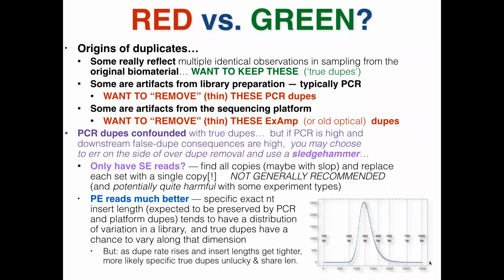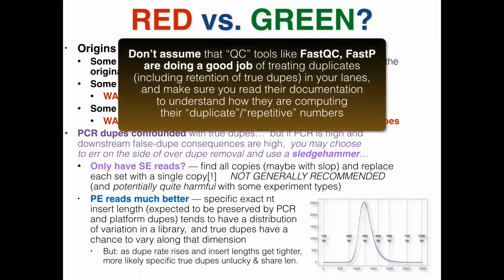Right? So if the typical size of the dupe group is 2, that means you're only comparing 2 draws from this distribution. If the typical size of the dupe group is 1,000, I'm going to have more random values of the property. So it's not perfect, but that gives us the idea.